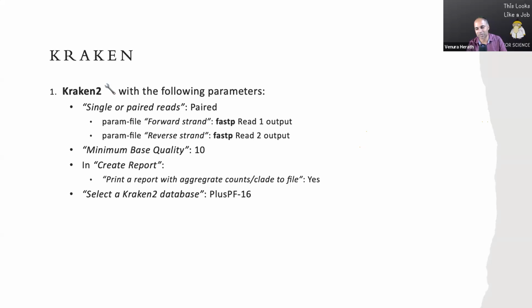But select whatever the closest option. We'll see what kind of output we are going to get. No problem. So, excuse me, sir. Yeah.